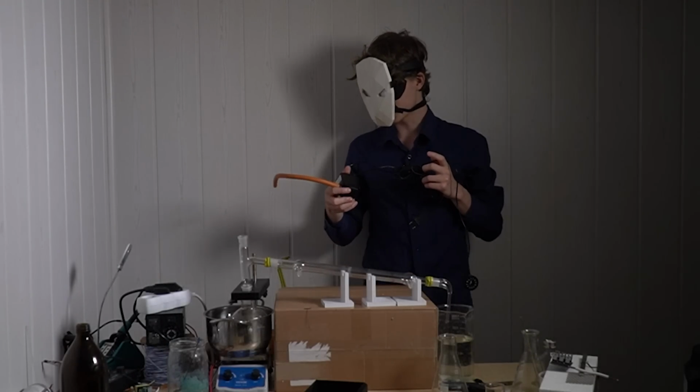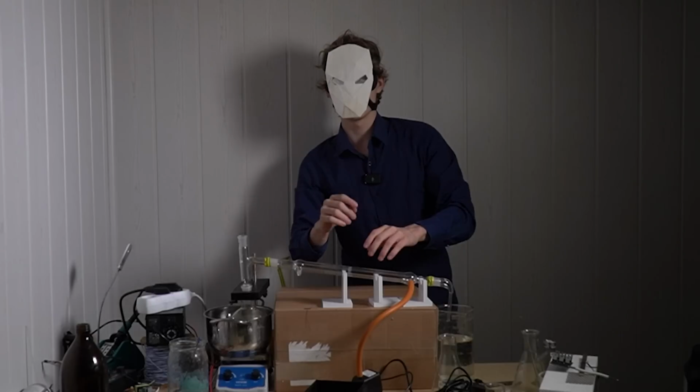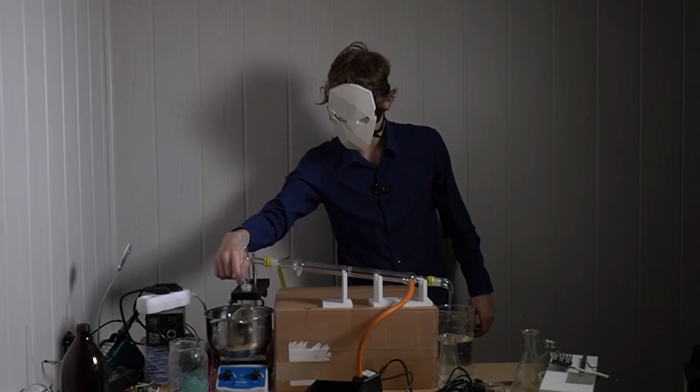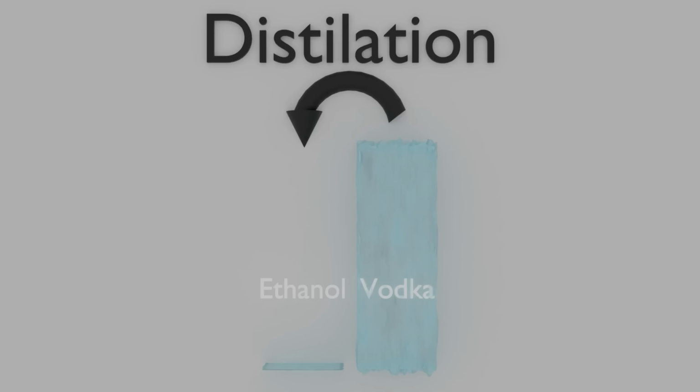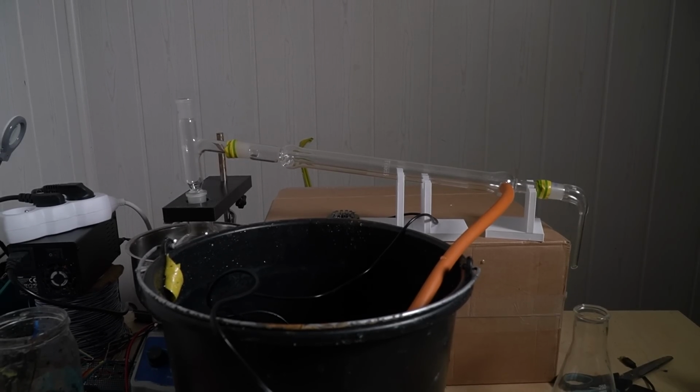So I got this water pump, and yeah, if any of you are wondering, what if this plastic will melt? Well, I'm wondering that too. The reaction we'll do is pretty simple. We'll just take some vodka, we're gonna distill it to get some ethanol and kind of water or whatever's left there. Okay. First we're going to start simple.